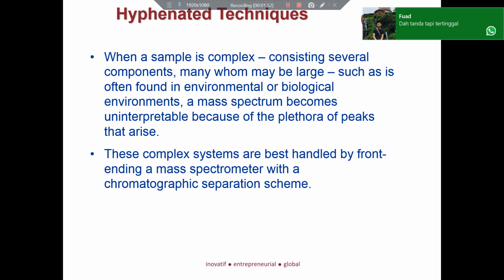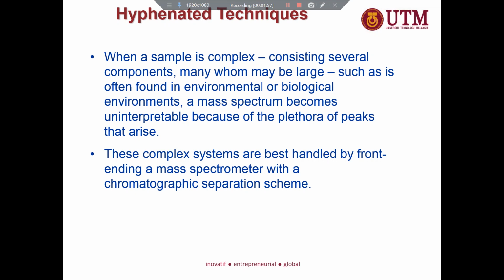But the problem is, if your sample is pure, then it's okay. But if your sample is not pure, then it will become a problem. Then you need to separate your mixture first, then you submit it for mass spectrometer analysis. That is by combining the chromatographic and also the mass spectrometer.